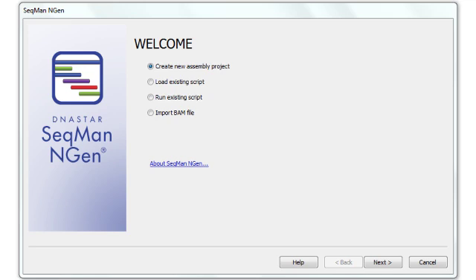In this video, I'm going to walk you through assembling and analyzing PacBio amplicon resequencing data using SeqMan Engine. The data set I'm going to use for this demonstration consists of 48 amplicons for the cancer genes EGFR and MET.